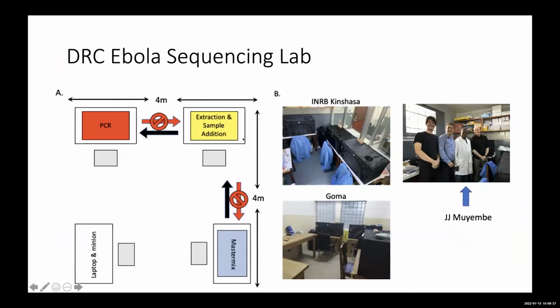And the way that this works is you have 3 tables with isolation cabinets all in one room. So this isn't generally considered to be the ideal approach to have pre and post PCR in the same room, but we're saying that you can do this in a small area, provided you have the additional containment of these separate cabinets, and you're very disciplined about the work that you do.